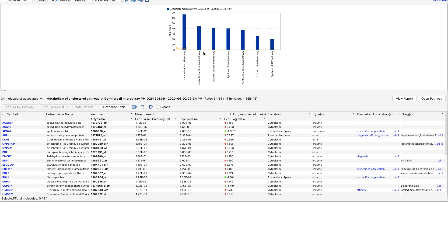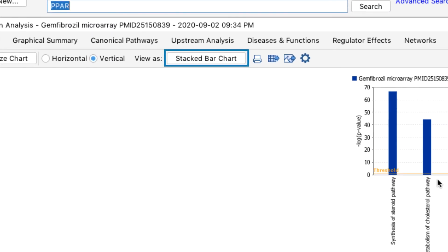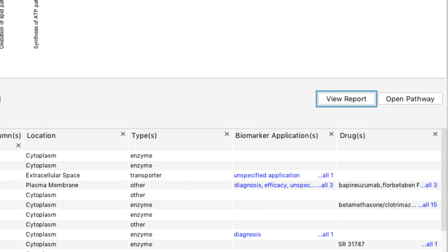Just like the canonical pathway bar charts, you have options to customize the chart, view the stacked bar chart, view information about your MyPathway, and more.